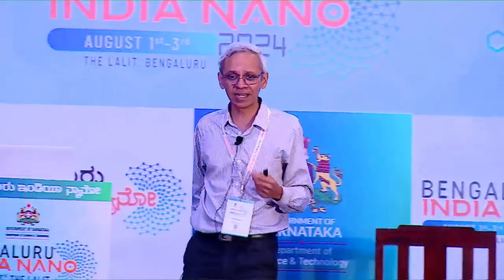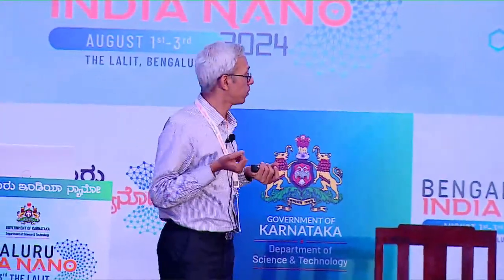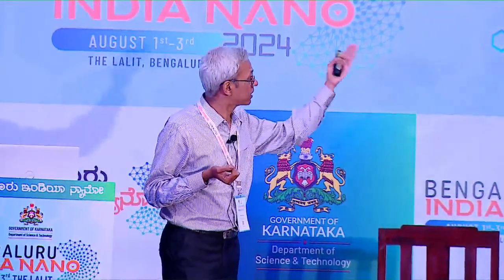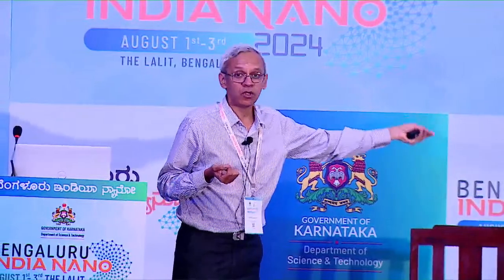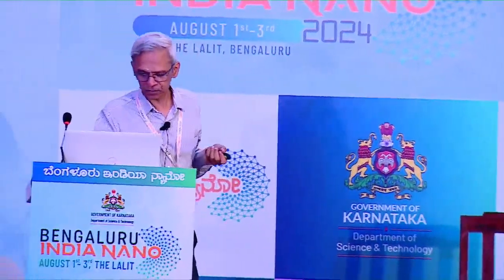Therefore, one of the golden rules is that whenever you see a good region, move that region away from the electron beam. Then you can do all your alignments and other things, and just before you want to image, bring that region back so that you can do your recording and so on, right? So don't expose the electron beam more than necessary. That's another simple and most important rule that you always follow, right? So the point is that in spite of all these advantages, you have a significant number of disadvantages also. So you have to keep that in mind, okay?